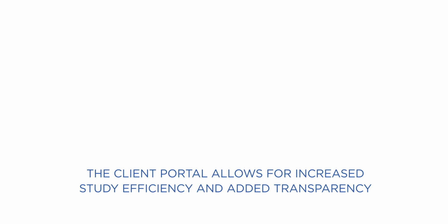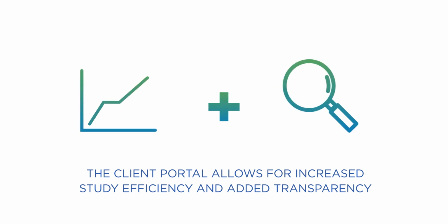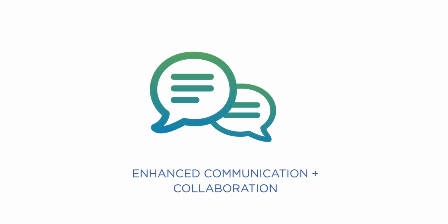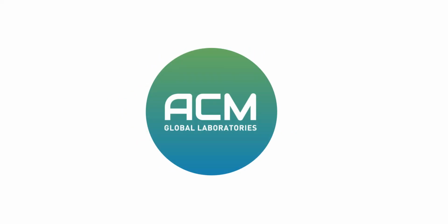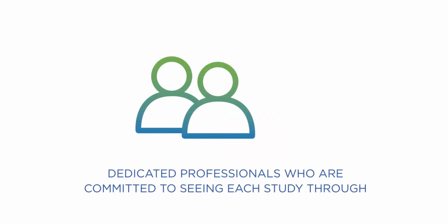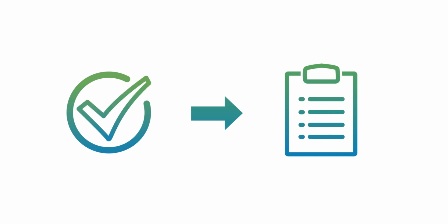The client portal allows for increased study efficiency and added transparency, in addition to serving as a tool for enhanced communication and collaboration across the study spectrum. When you partner with ACM, you're not only partnering with an organization that understands the importance of these elements, you're partnering with a group of dedicated professionals who are committed to seeing each study through with the care and intention they deserve.